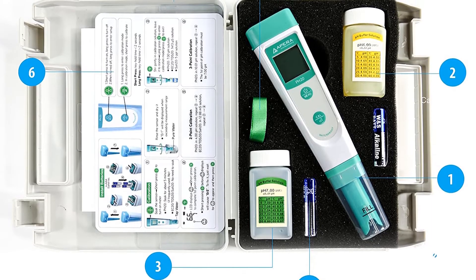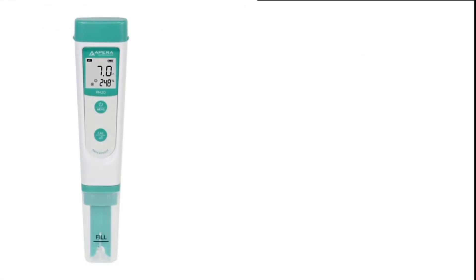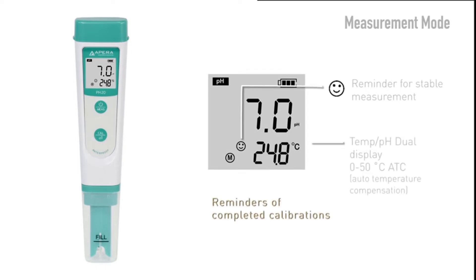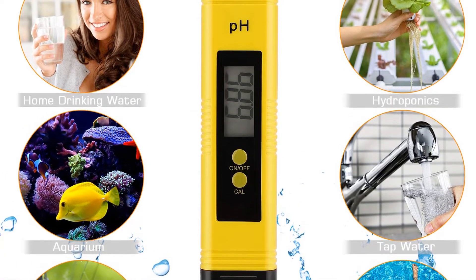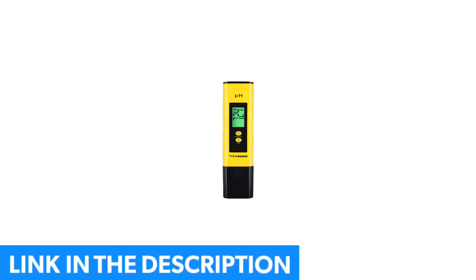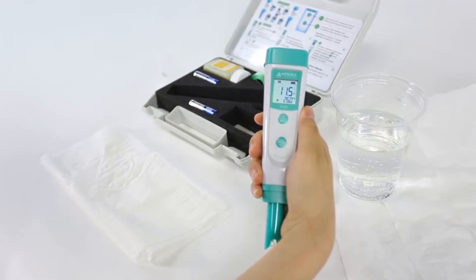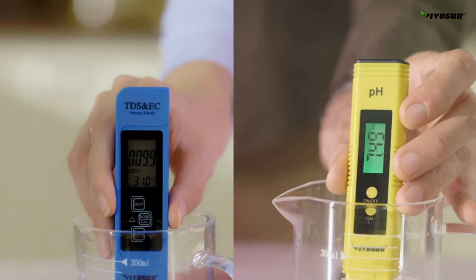The Apera Instruments Waterproof pH Tester is another great example of a quality starter pH reader. This meter is battery-powered, giving up to 2,000 hours of continuous runtime. It comes with auto-calibration and an excellent pH sensor to give you a high response rate. The Apera pH tester includes a lanyard, two buffer solutions, and a carrying case. Customers get a two-year warranty with this product. One con is that it's a bit difficult to calibrate — it often takes more than one try, and some customers had to cross-check it with another meter to make sure it was correct.